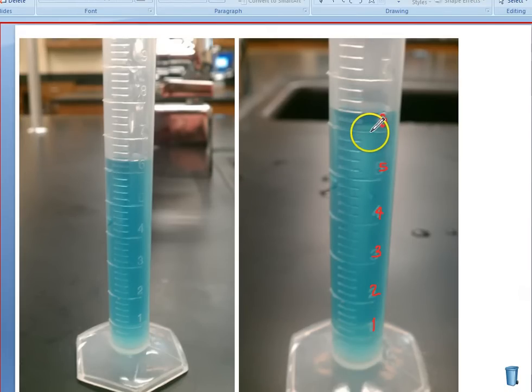If each line were 0.2 milliliters, this would be 6.2, 6.4, 6.6, 6.8, 7. So that is what those lines represent. Since my water line stops right here, I can tell that I have 6.4. It's right at that line. So I'm going to say 6.40 milliliters.